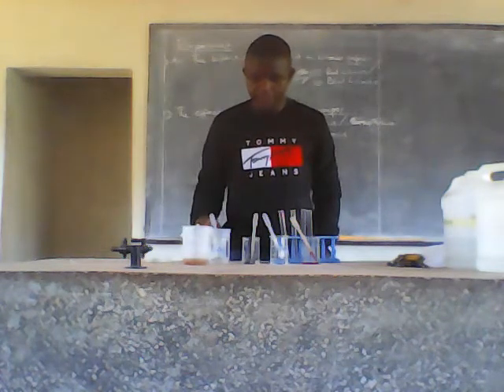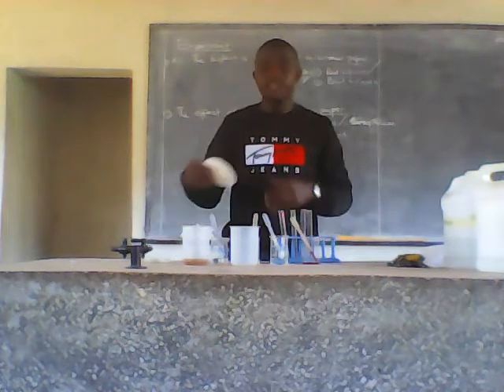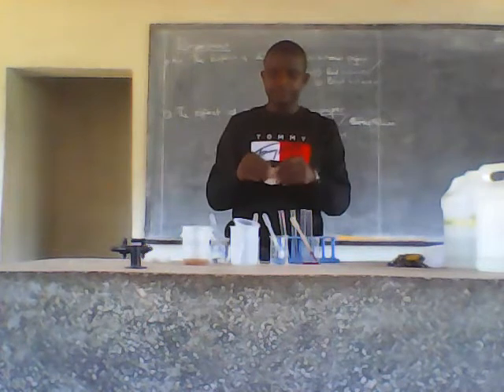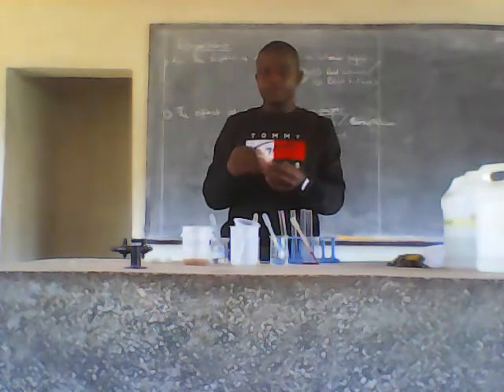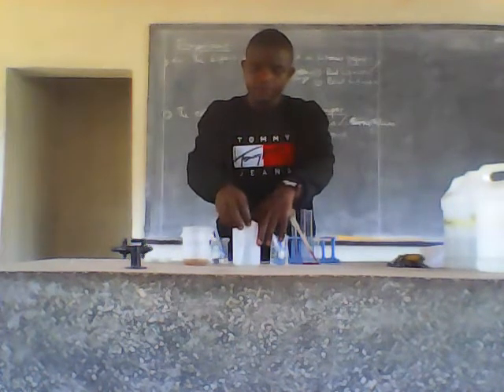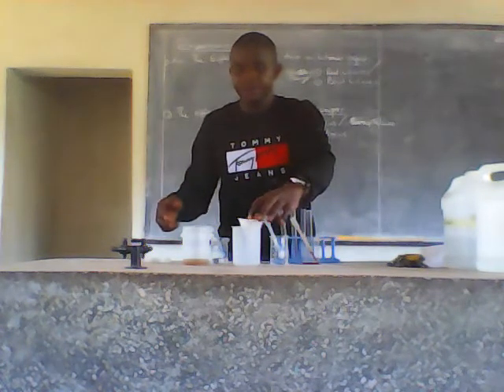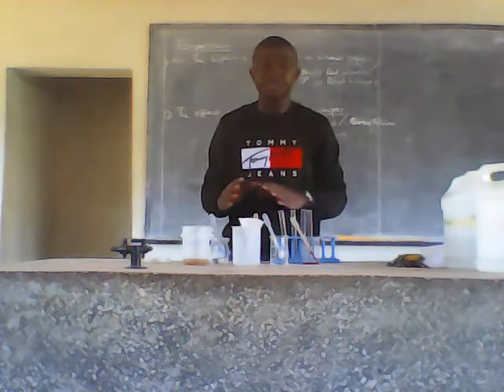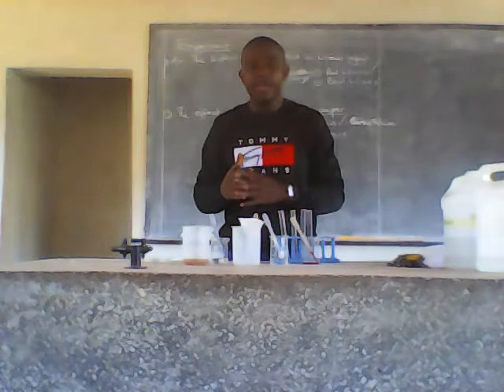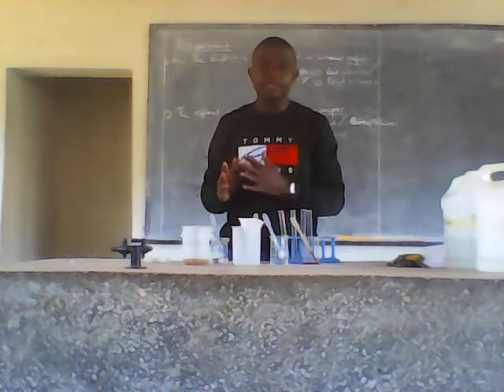Then I'll get my empty beaker, put my filter paper, and place it into the funnel. The main purpose is to do this filtration — I'm just trying to get the filtered part of the sample, and then I'll use that filtrate to test for the anions and the cations present in the sample.